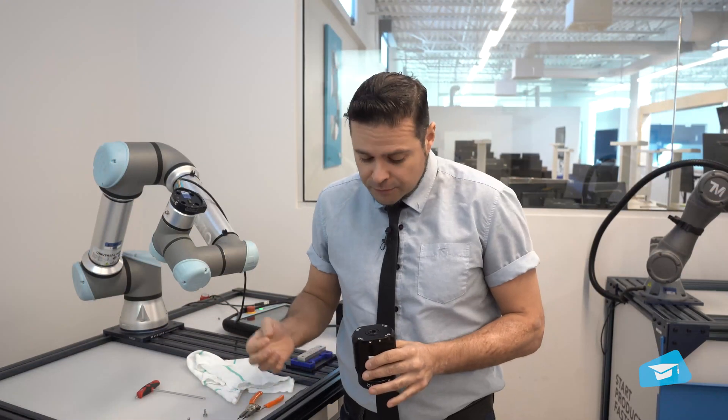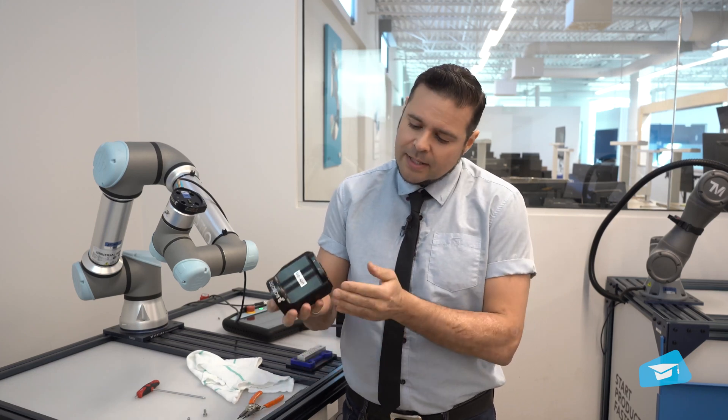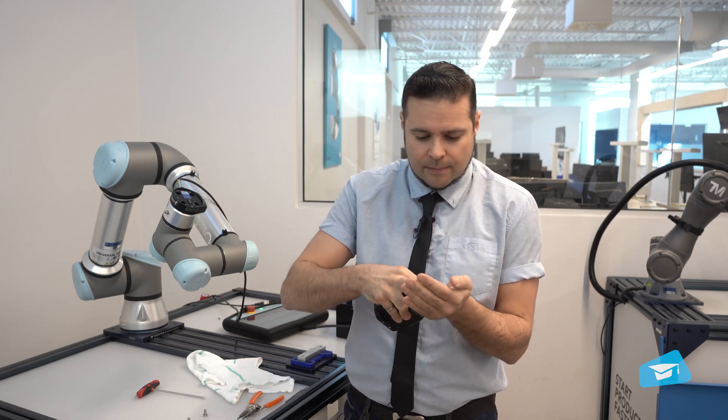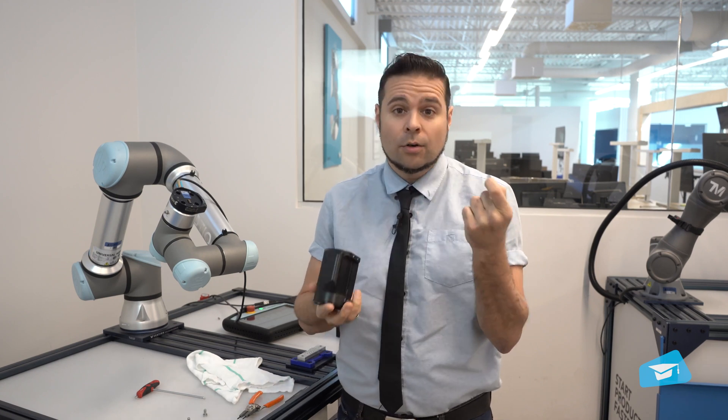Now that the snap ring has been removed, you want to take out the filter. If you're lucky, just by turning the EPIC upside down and shaking it a little bit, it will come out. Then you can either clean or replace it.